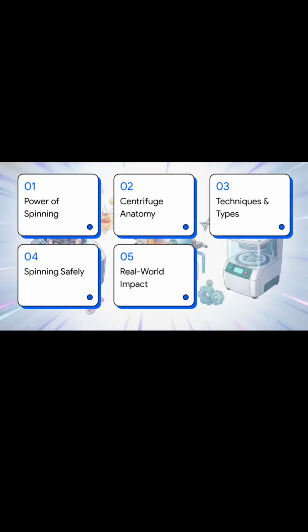So, here's our agenda for today. We're going to look at the power of spinning, the anatomy of a centrifuge, techniques and machine types, how to spin safely, and finally, its real-world impact.